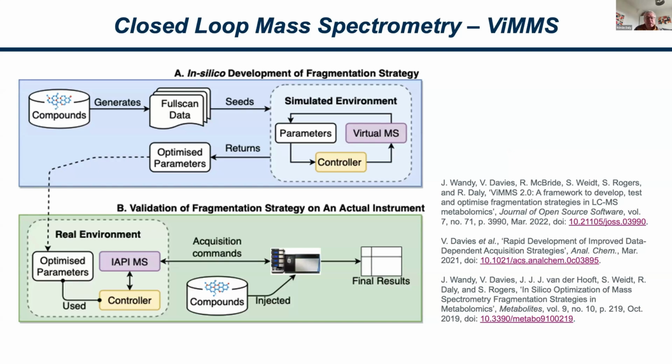And we were able to design the system and actually run it, test it and validate it on real LCMS runs, and we were able to show that we were able to get better fragmentations and better data out the end, that we were able to perform much better identifications for the metabolomics data, and that would help people analyze their data in a much better manner.